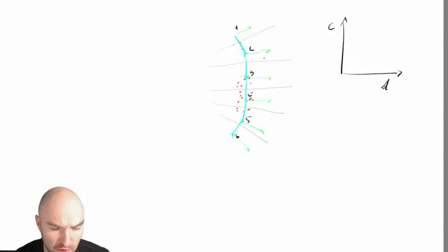So the question is, first, how do I pick where, if it makes sense, if there's a difference. And the next question is, how do I find the individual vertices, or how do I mark them for analysis? But it's this Voronoi decomposition that's actually the core of everything. It's not necessarily an explicit one.